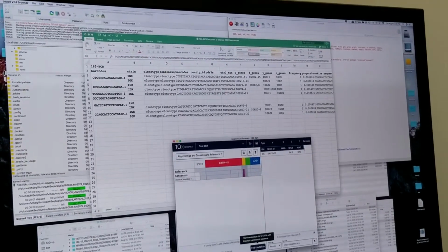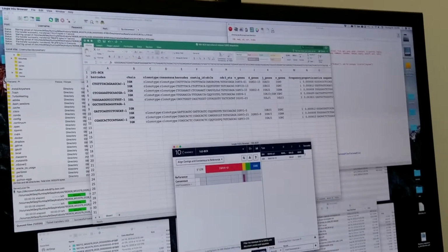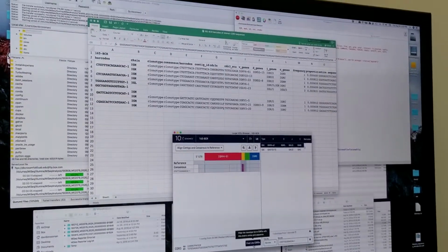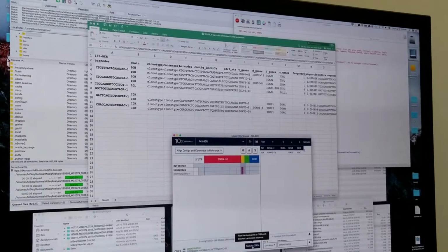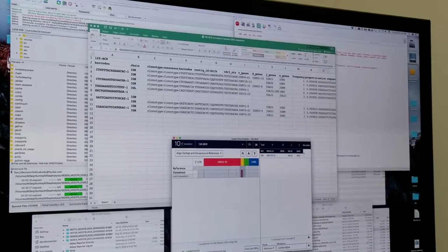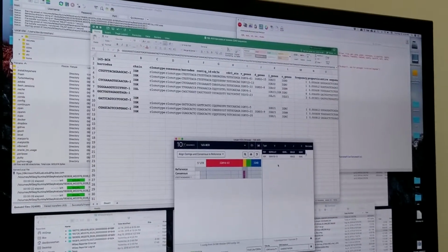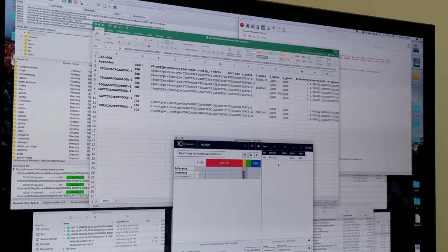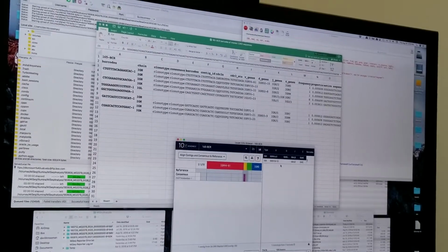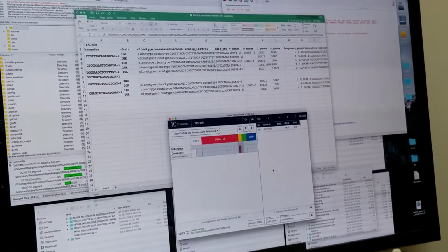I know I've been intrigued with this button, Find Like CDR3. Oh, there you go. Try that. It says filter the clonotype list to CDR3s with this chain's amino acid sequence. If I click on it, it now switches this over to CDR3 amino, takes that amino acid sequence and puts it here, and searches the entire list of everything that has been sequenced in your samples, and it's still the same one sample. Oh, I see. It's only going to work with that sample. It's only going to look inside of the file, I guess, is how that works.